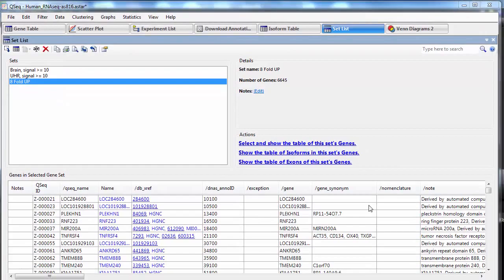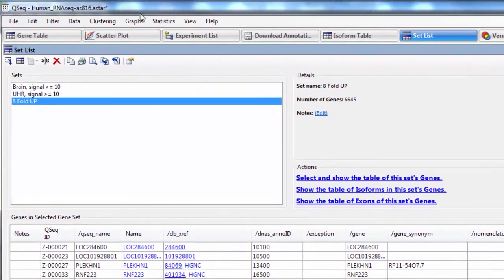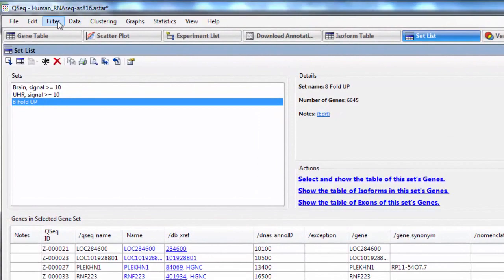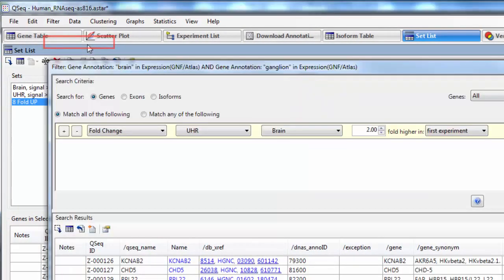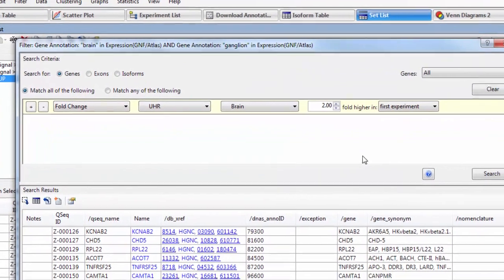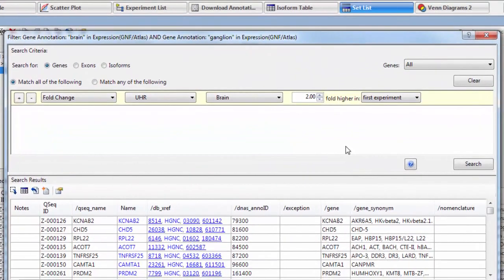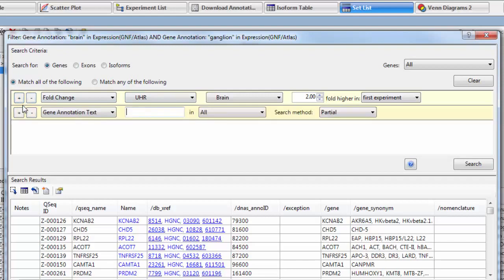I'm going to create one more gene set, this time using the advanced filtering dialog, and you can access that by going to Filter, Filter All. This dialog allows for a lot of complexity in your searches. You can add and remove different criteria by using these plus and minus buttons here.